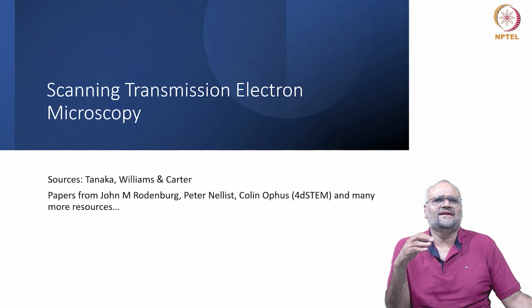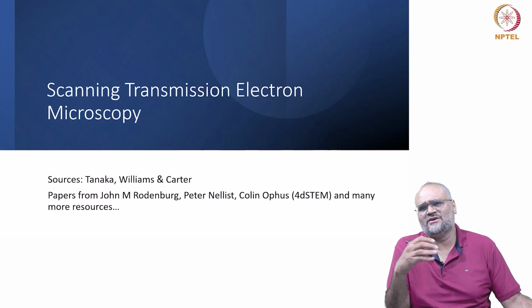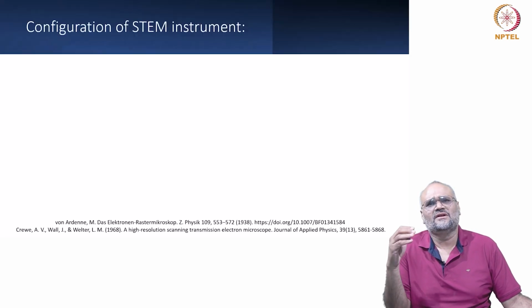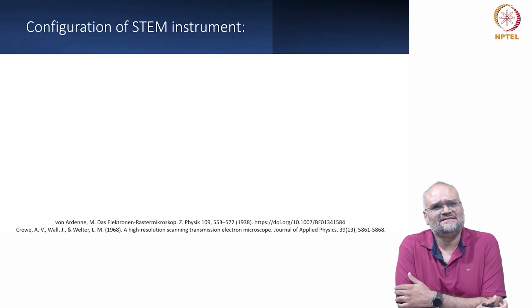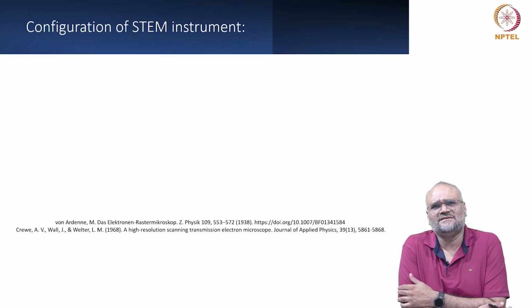In this lecture, let us continue our discussion on the technique of scanning transmission electron microscopy. I'll just continue from where we left off in the previous lecture. I'll show you one of the very first designs of the STEM microscope, which was configured quite some time ago.